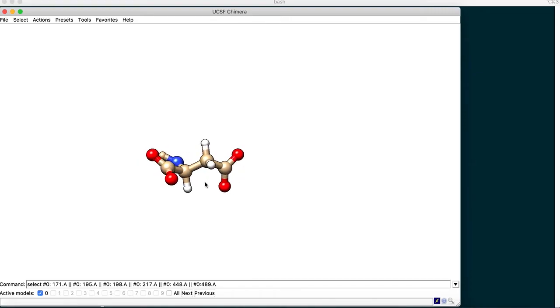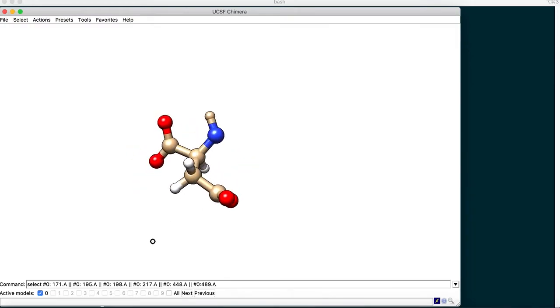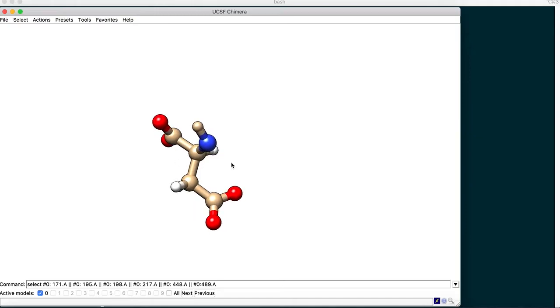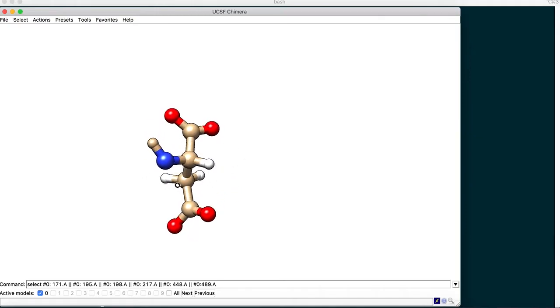this L-Asp to D-Asp. The orientation which we must follow in order to have a proper assertion for the CORN rule is basically having the carbon center, which is the chiral carbon, that's the C-alpha carbon, at the center, and the nitrogen on the left to represent the L form, the L-enantiomeric or stereoisomeric form of the amino acid aspartic acid.